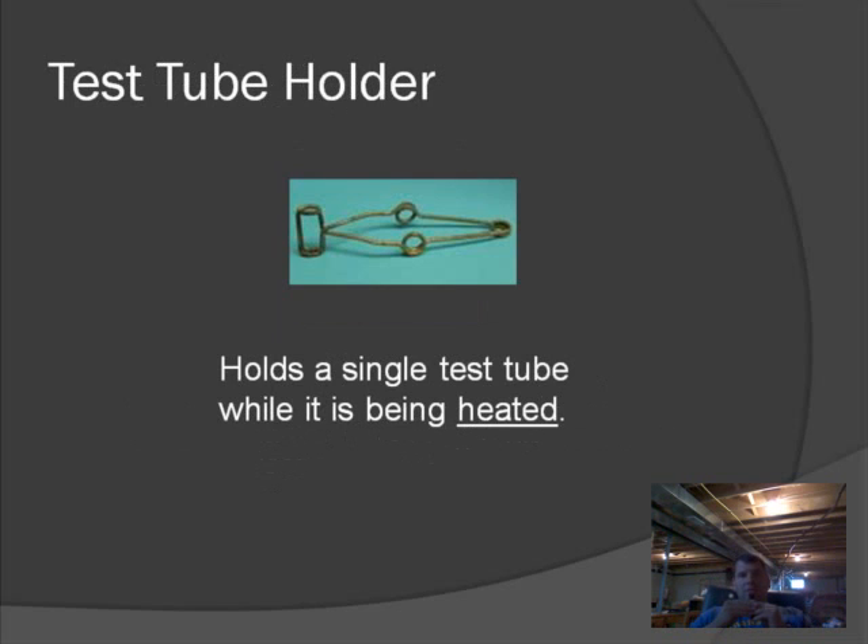The next one is a test tube holder. This device is used to hold test tubes while they're being heated. Since test tubes are made of glass, if you're going to heat a chemical in one, the glass is going to get extremely hot, so you never want to hold a test tube while it's being heated. This device lets you hold the test tube without burning your fingers — you squeeze the sides, the clasp opens, you put the test tube in, let go, and it holds the test tube for you.